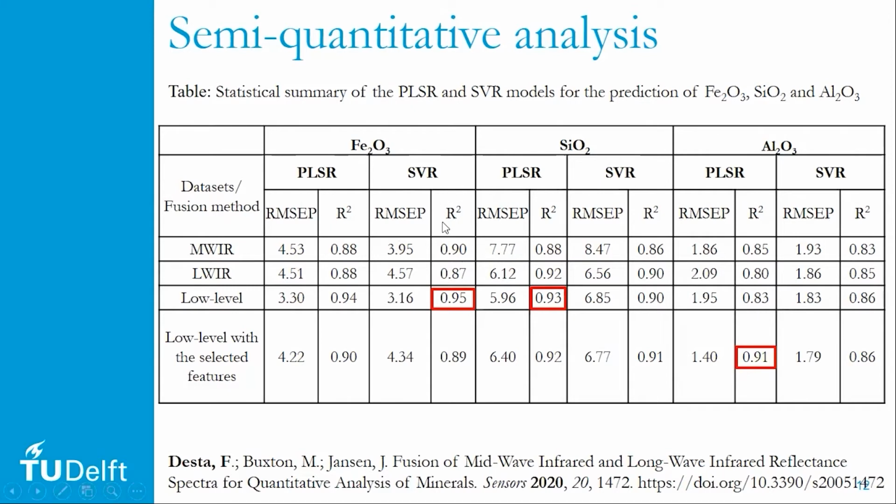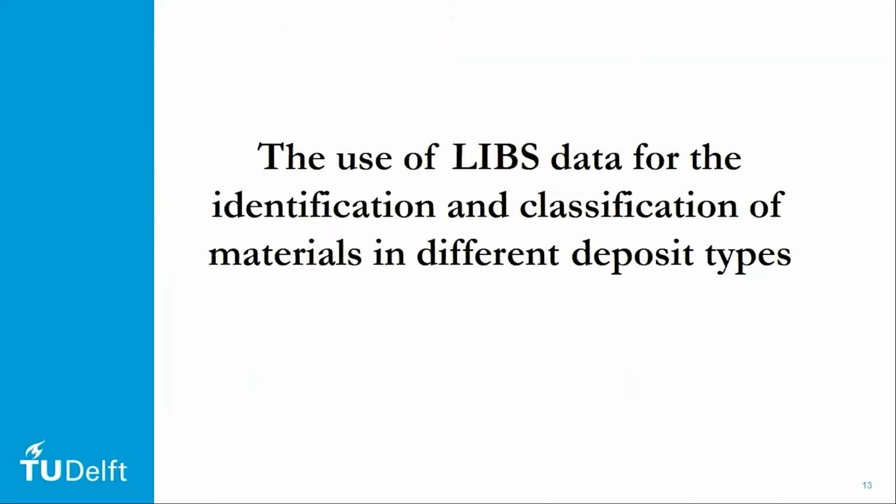Although the acquired prediction accuracies are lower than those of the standard laboratory-based techniques, we believe that the proposed method is suitable for rapid in situ indication of mineralogical concentrations along the mining value chain.